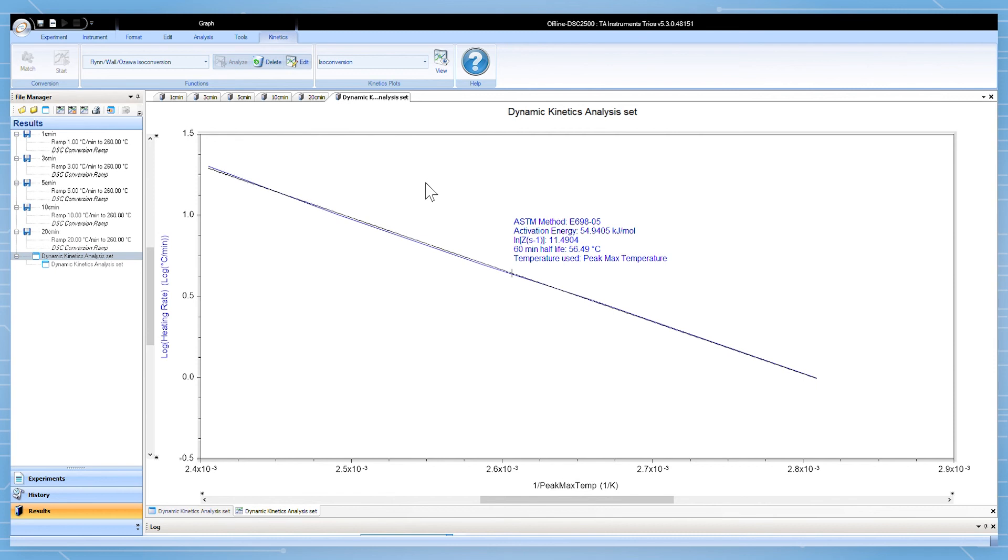After the kinetics analysis has been performed, isoconversion and isothermal predictive plots can also be generated. Select the desired plot from the drop-down and click view.